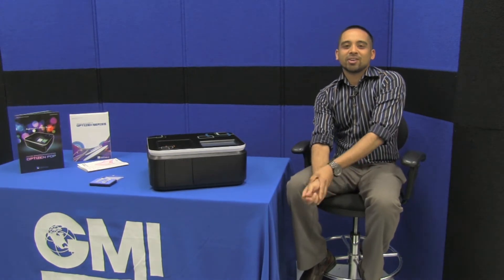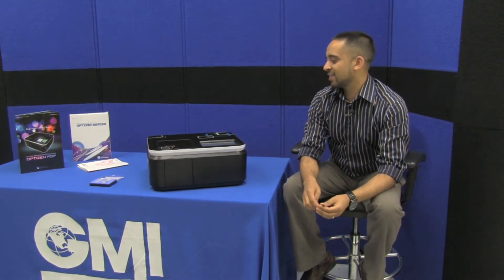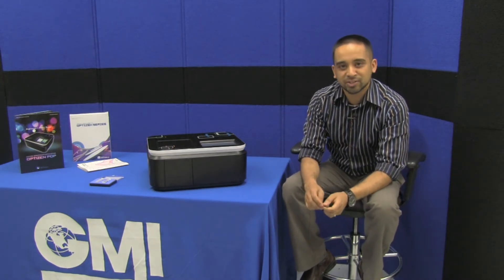Hello and welcome to another product review from GMI. Today we're going to be looking at the Optizen Pop Series UV-Vis Spectrophotometer.